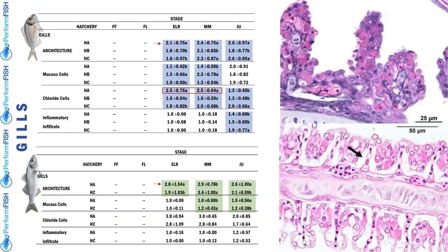In OCV, I remind you, we put all the alterations, regressive and progressive. So if we have the possibility to analyze all the fish inside a batch, of course, some alterations are present.